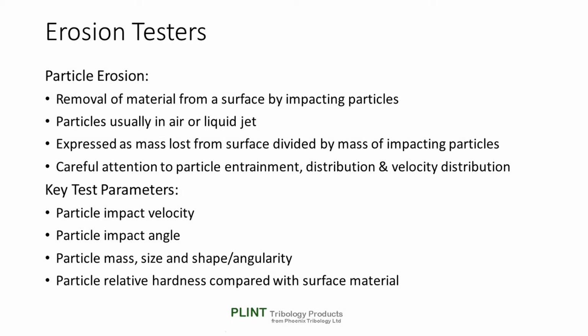Erosion is normally expressed as mass of material lost from the surface divided by the mass of impacting particles, with mass loss increasing linearly with mass of erodent from the start of the test. It is important to note that under certain circumstances there may be a significant incubation period before wear commences. The use of hopper feed systems for abrasive particles once again improves the uniformity of supply, which in turn enhances control of the particle loading on the contact.